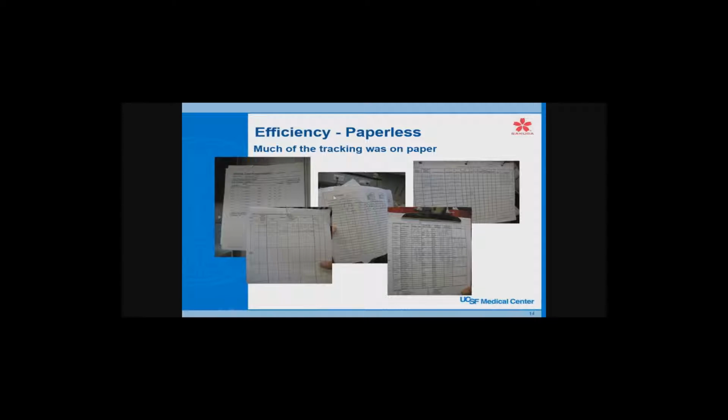So we've got couriers crisscrossing all day long. We've got 3 different couriers rotating around all these different sites all day long. And so it's a constant process to try to keep track of everything. So for this type of case, computerized tracking is essential. And as I said, a lot of the tracking we did was on paper.